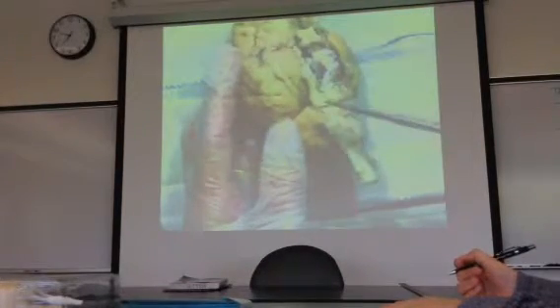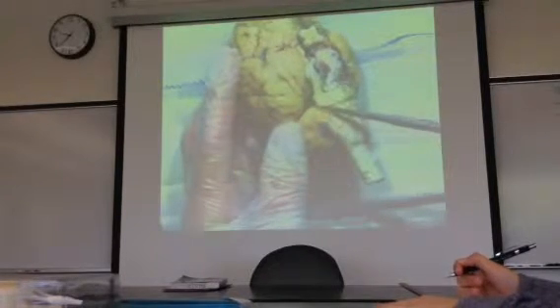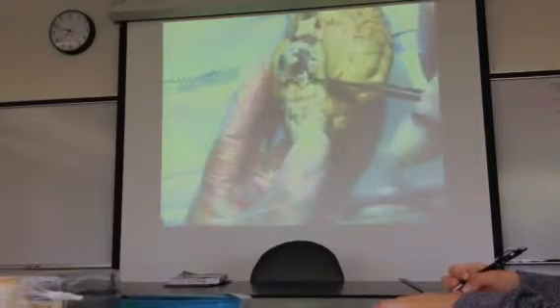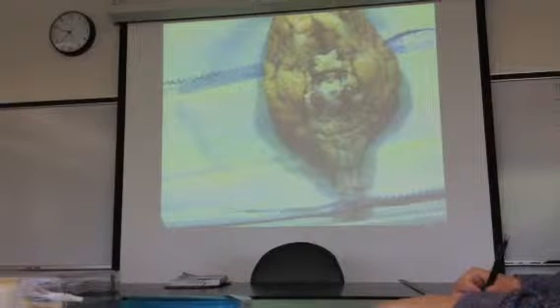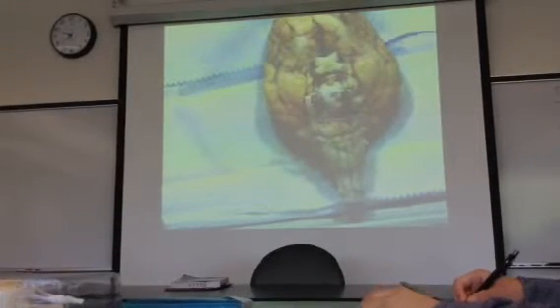Okay. You need to save trigeminal 5 too. So this is where trigeminal 5 is emerging from the brain. I want you guys to go up about 1 centimeter and just cut through it like that. Same thing over here. Go up about 1 centimeter and just cut through it like that. You've got to cut those cranial nerves before you try to take off the pituitary gland. And if you're not comfortable doing this, you're afraid you're going to ruin your study specimen, I'd be happy to do it for you. I can do it pretty fast.